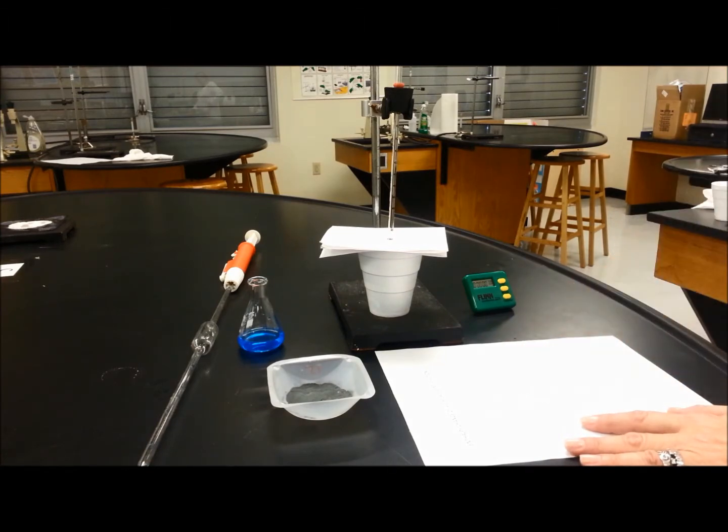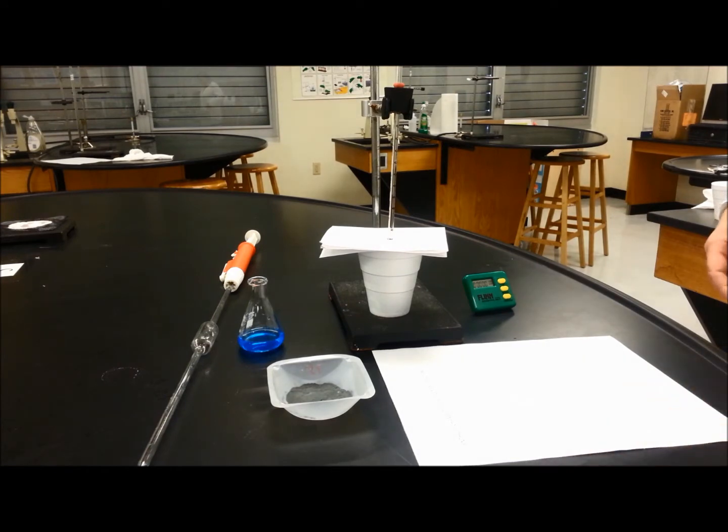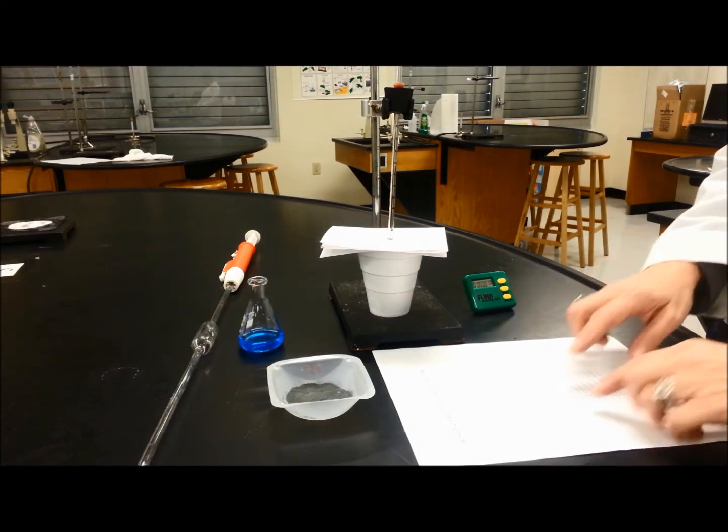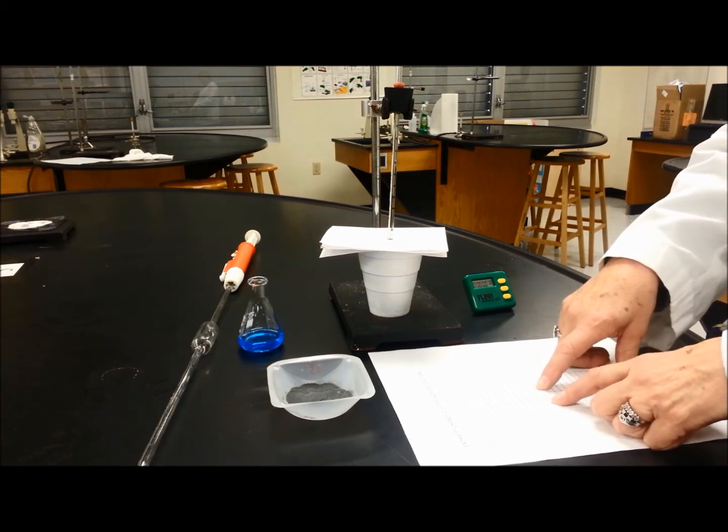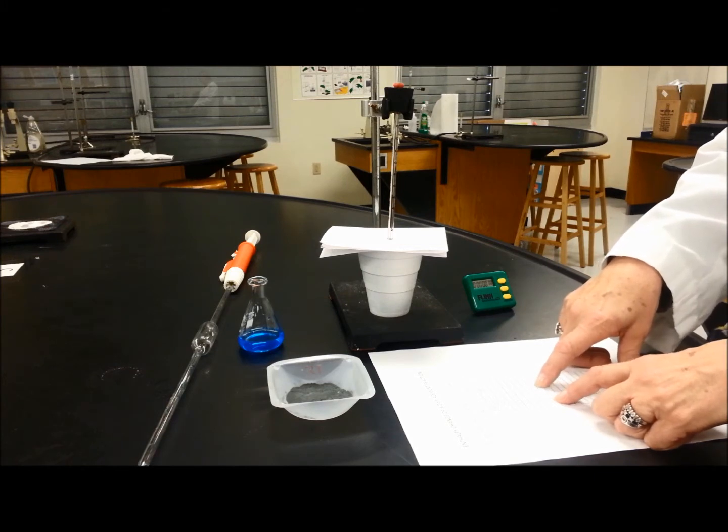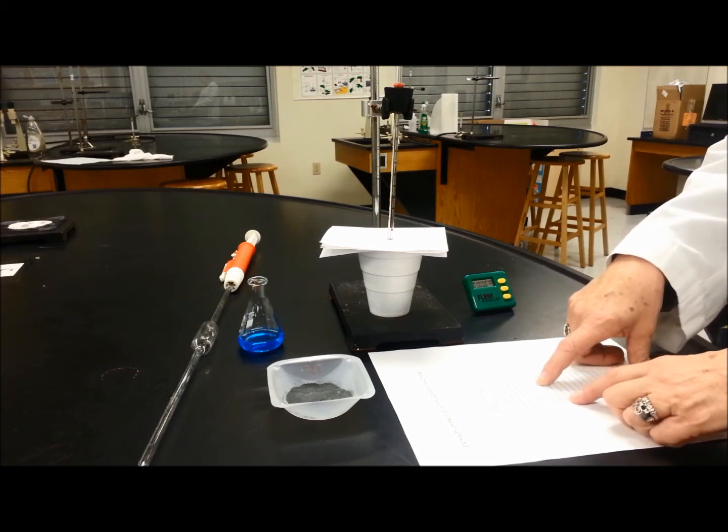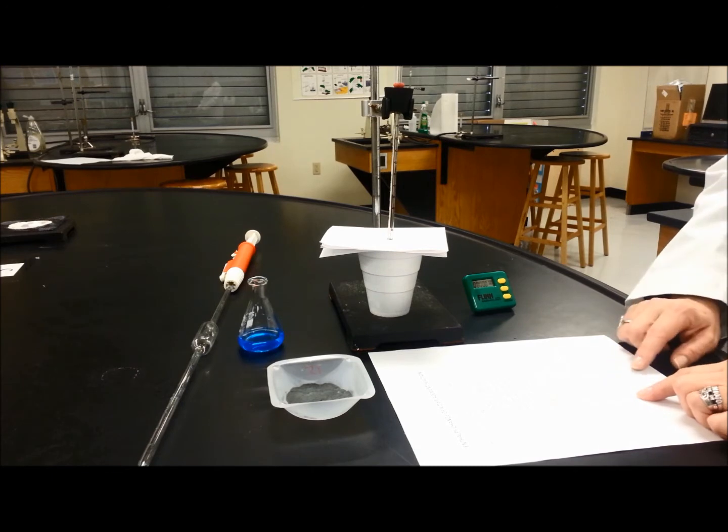When we get to three minutes, we do not record, but at three minutes exactly, we are going to put the powder zinc and then skip that measurement and then begin measuring again at 3.5 minutes and so on until nine minutes.